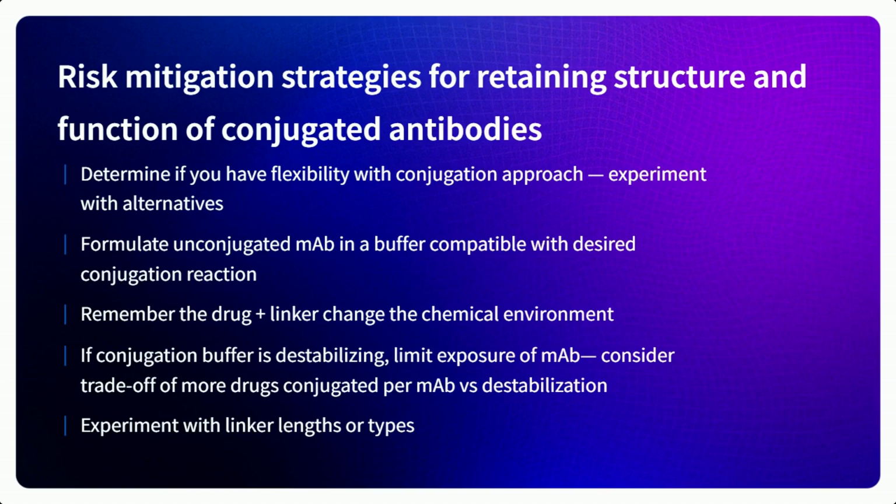Now, of course, it's not always possible to have complete flexibility when building a new ADC, but go in armed with as much knowledge as possible about the monoclonal antibody stability before conjugation to minimize the destabilization of it during conjugation.